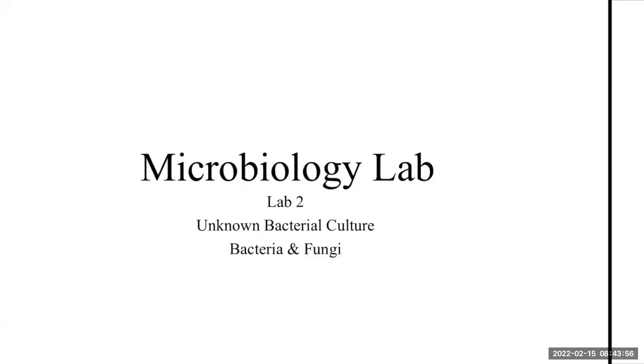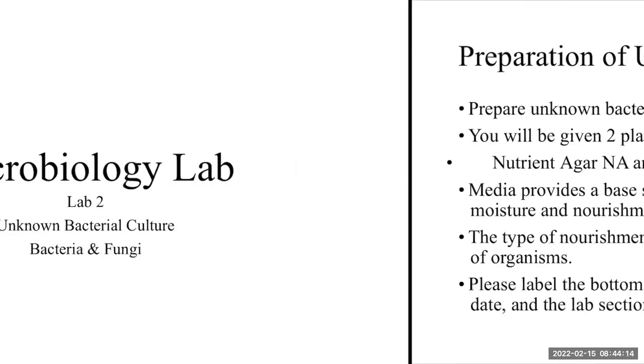Hi, everyone. Today, we're going to be going through Laboratory 2 for microbiology. We're going to start to develop an unknown bacterial or fungal culture, and we're going to be taking a look at some bacteria and fungi under the light microscope.